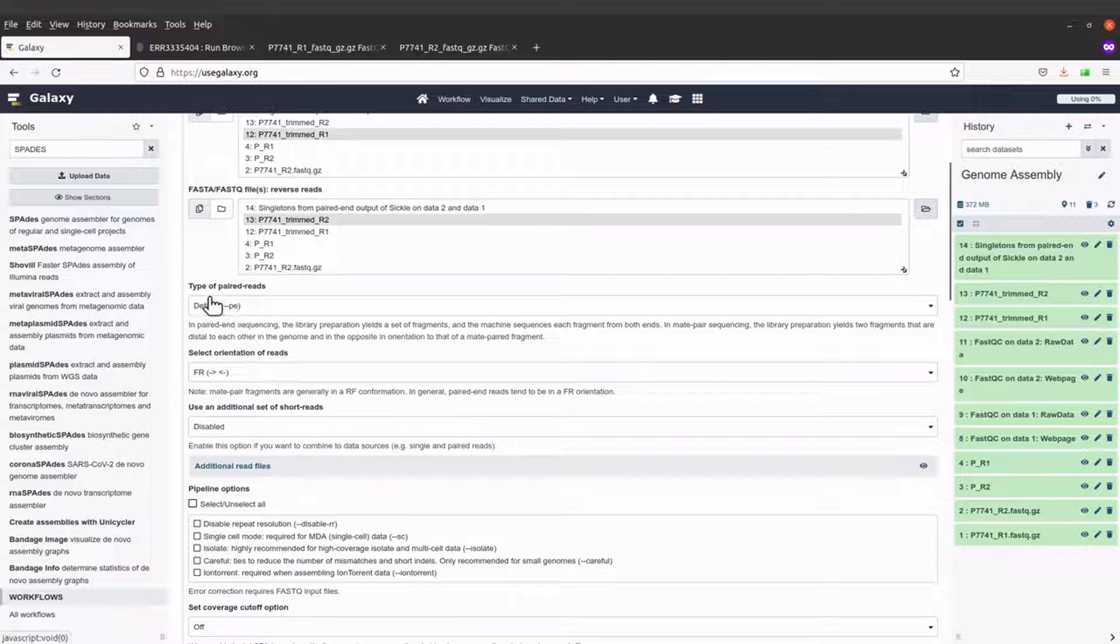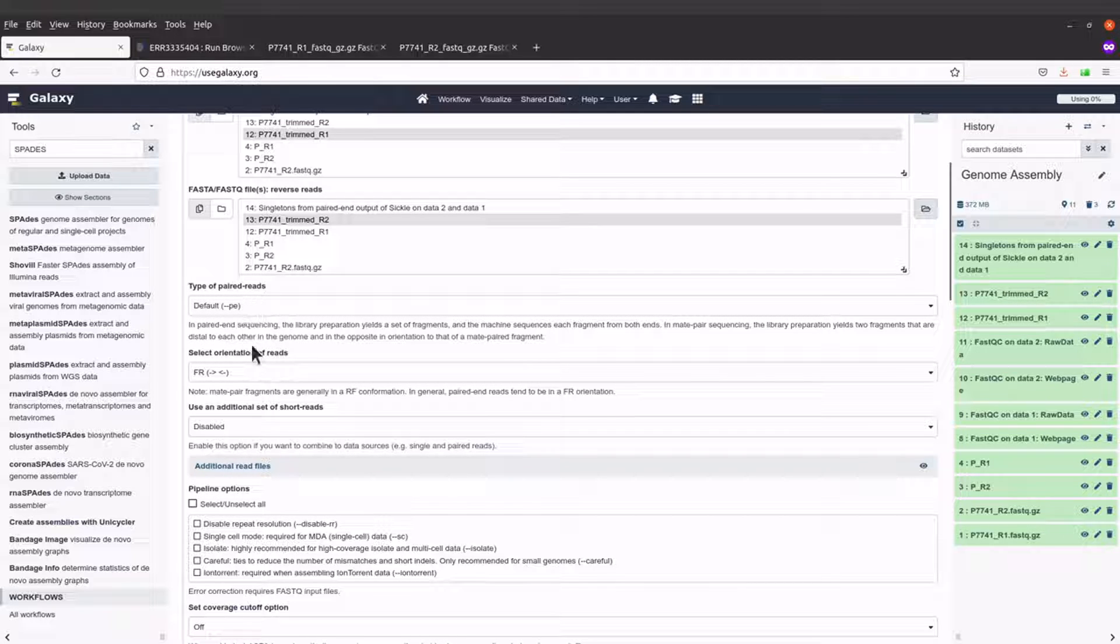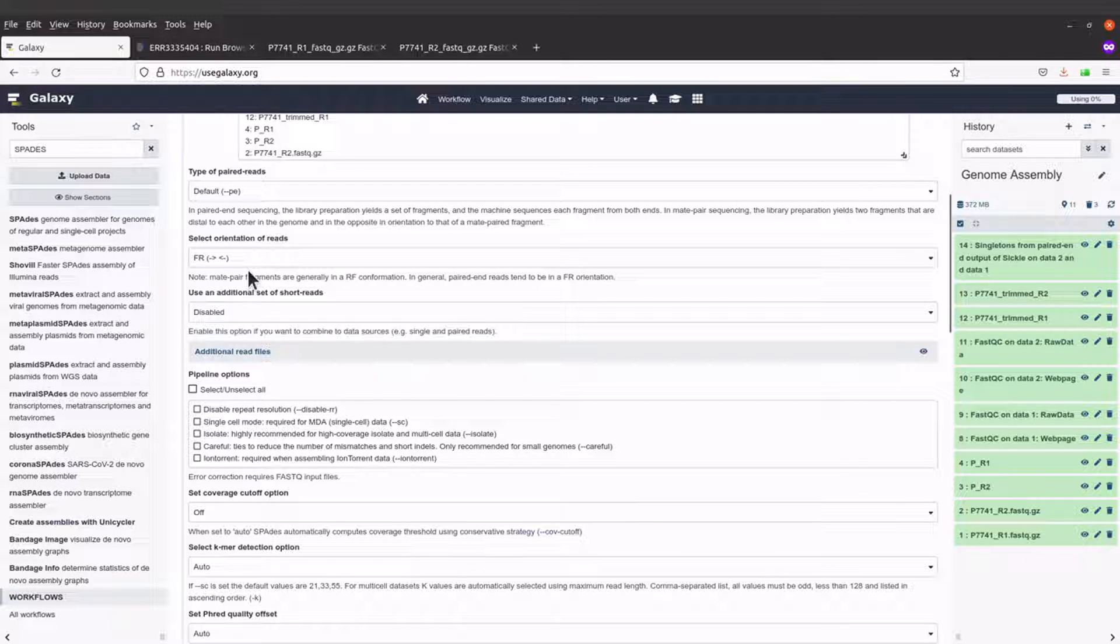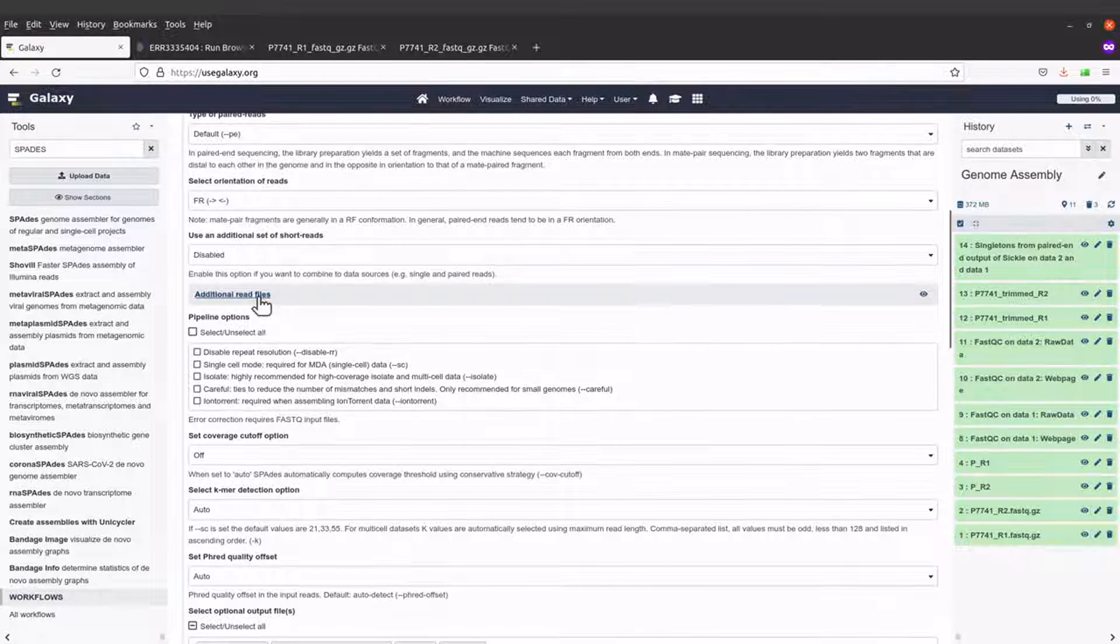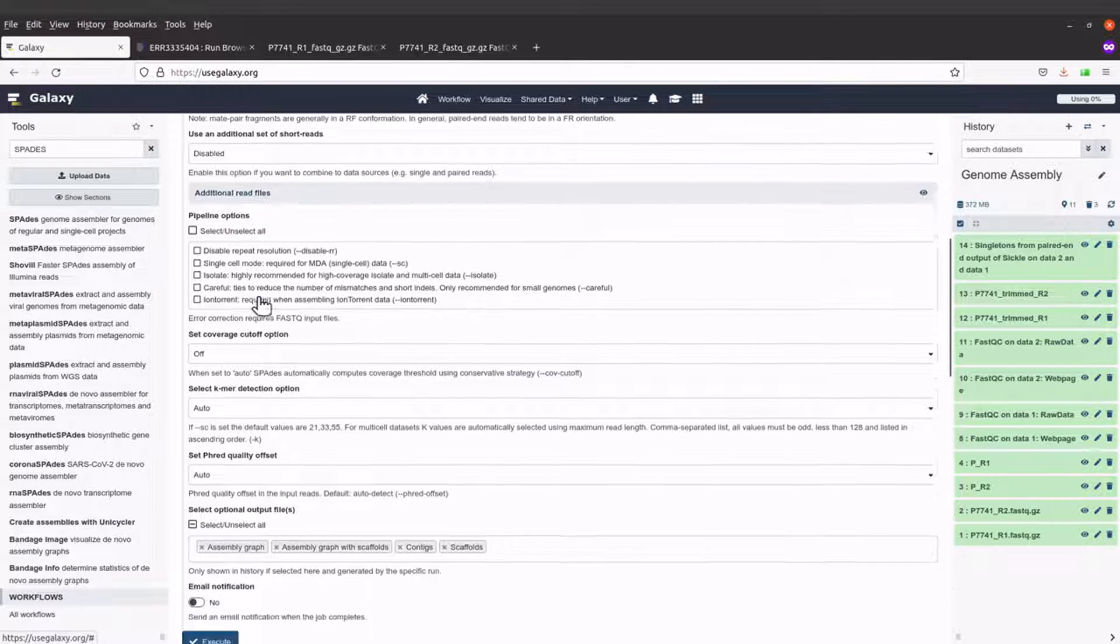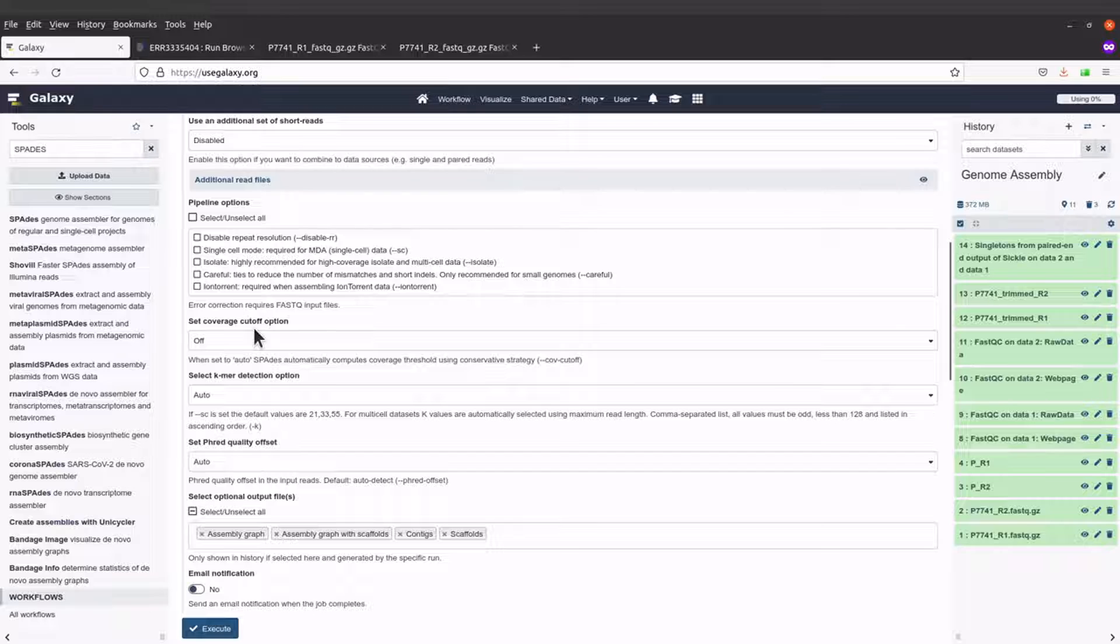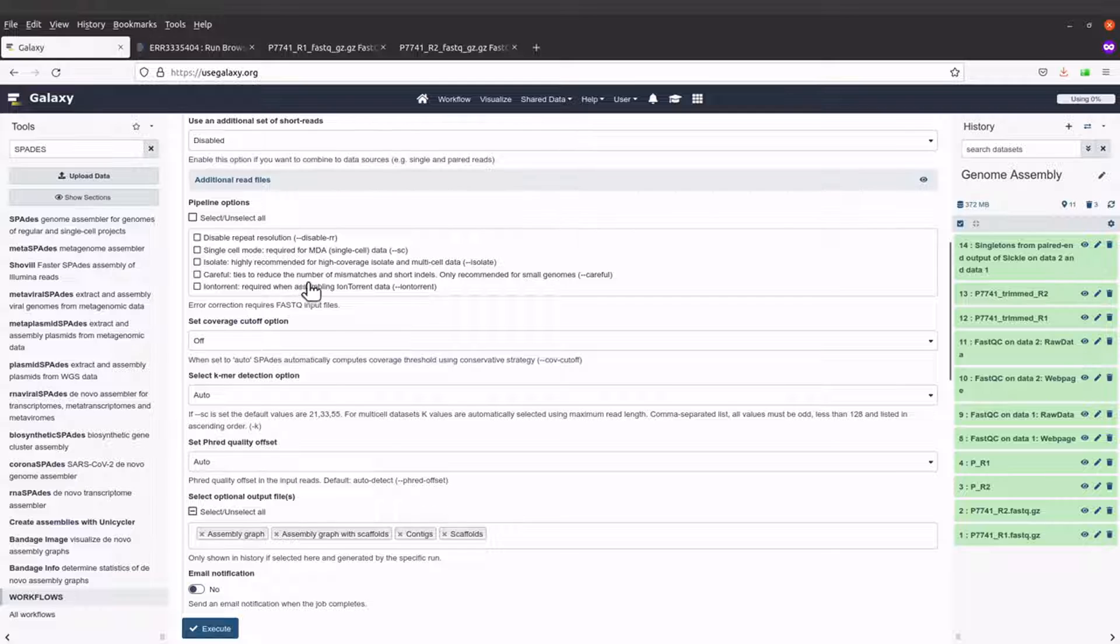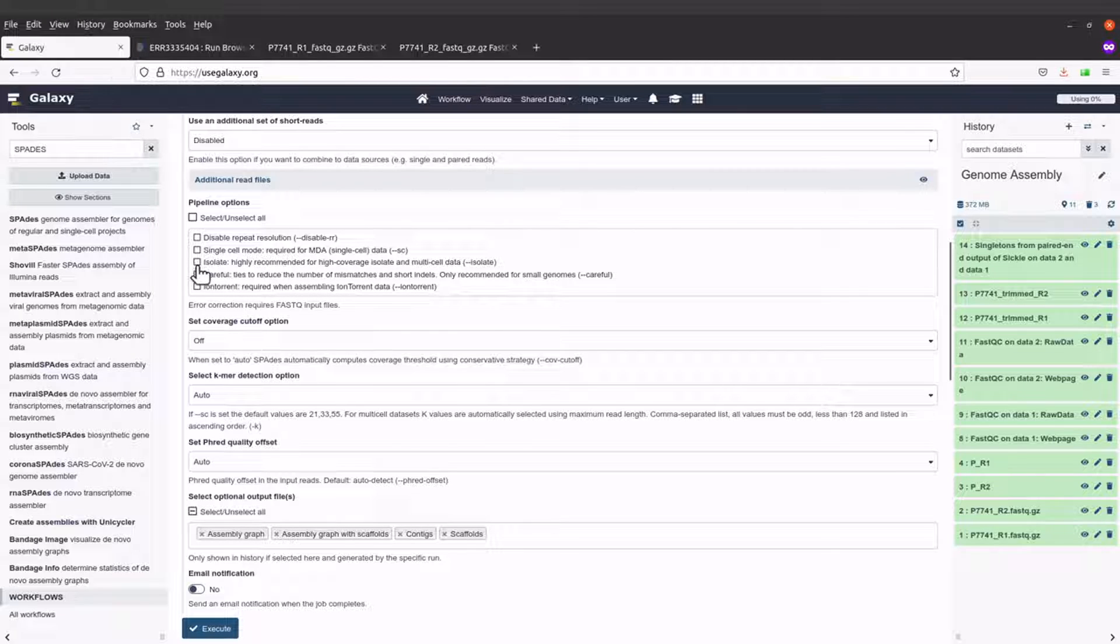Now with the type of paired reads, the default is what I'll use. For orientation, I'll leave everything there. When you come here, you can select some options.